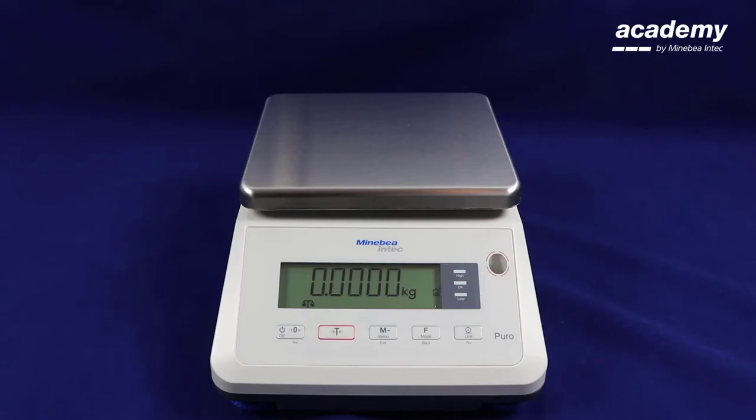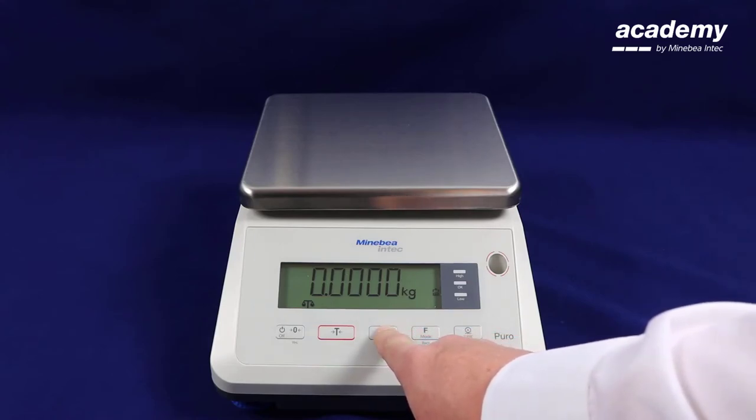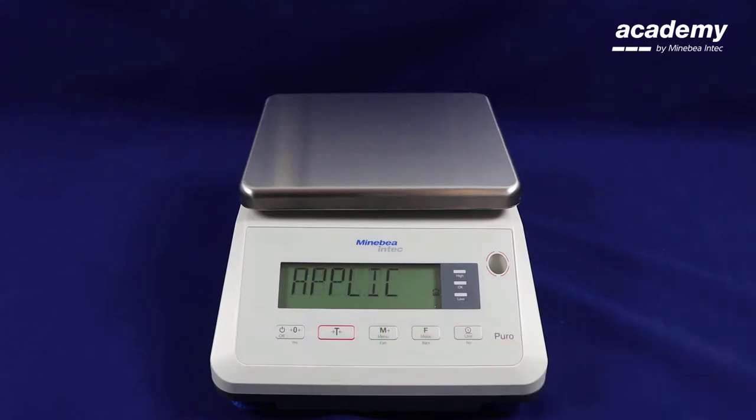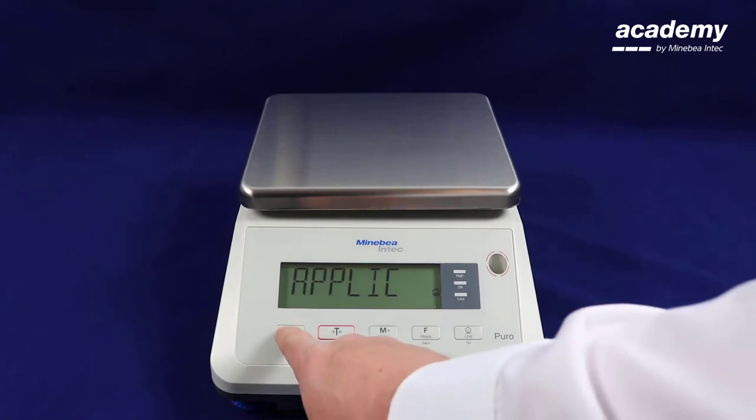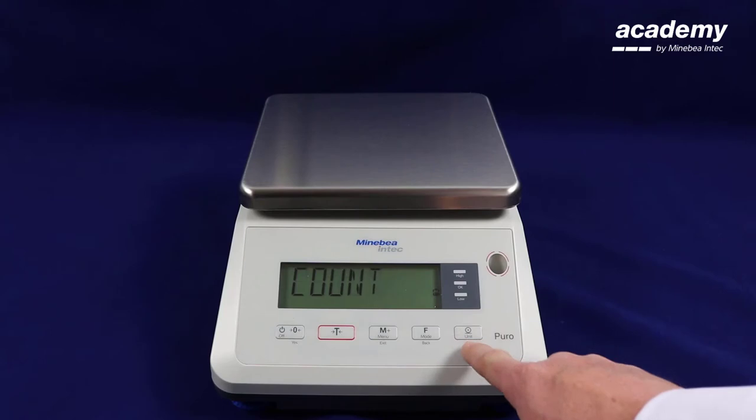The application has to be activated in the menu settings before we can use this. Press and hold the menu key in order to get into the setup. Use the yes key to accept on application and use the no key to scroll until you find the display hold function.